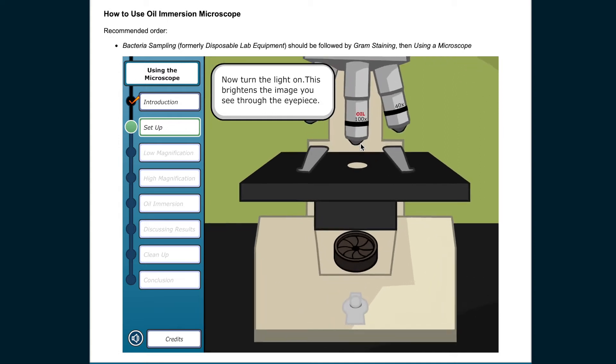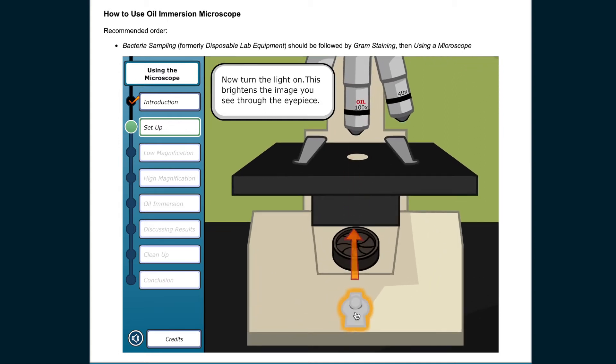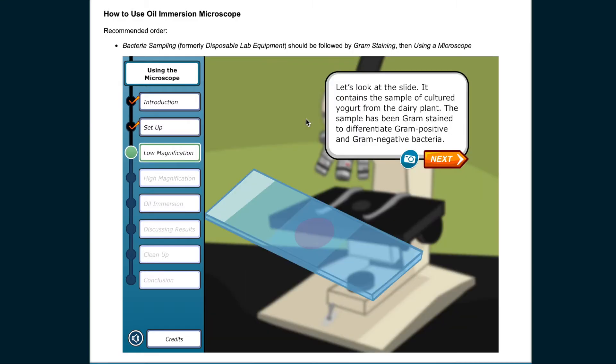Now turn the light on. This brightens the image you see through the eyepiece. Let's look at the slide. It contains the sample of cultured yogurt from the dairy plant. The sample has been gram-stained to differentiate gram-positive and gram-negative bacteria.